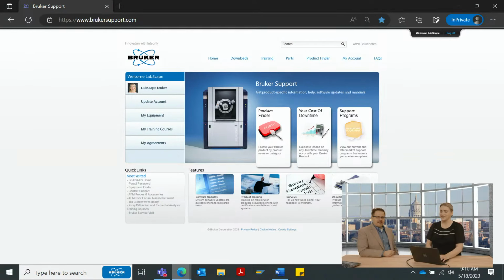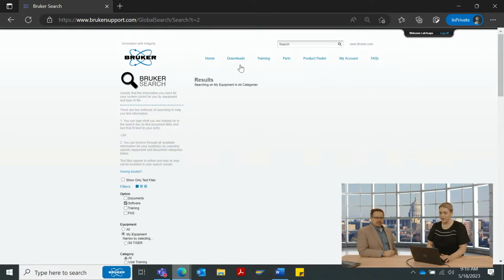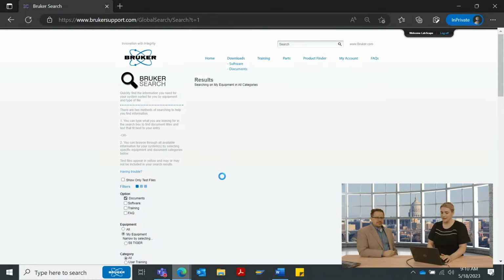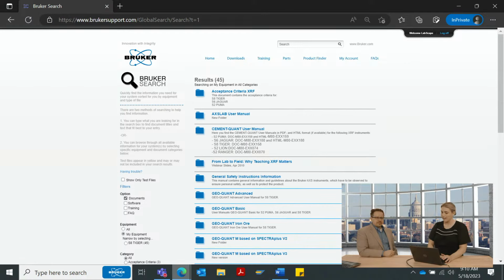Nope. So I will show you guys in a minute. Actually, I'll show you now. Let's go to brukersupport.com. Once you are a registered customer, if you go to Downloads and Software, you can see the software available for the equipment that you selected when you registered your account. You can also go to Documents and see all the documents specific to your instrument as well.